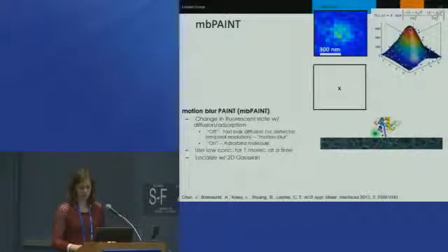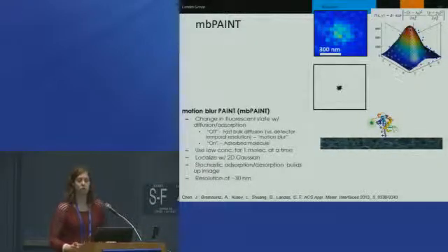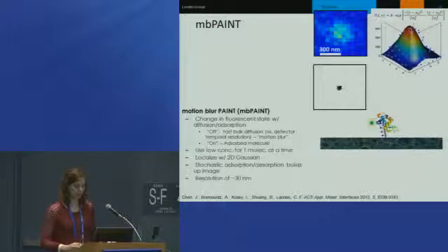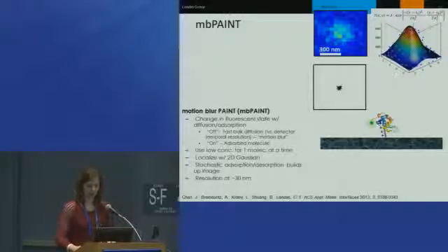And then, like I said, we adjusted the equilibrium so that it doesn't spend a whole lot of time in the off state. And so when we have multiple events, we can do this statistical analysis over and over again. And the combination of these statistics then allows us to create a super resolved image in which we've broken the resolution of light, the diffraction limit, and gives you resolutions that approach things like 10 nanometers or even below, depending on some groups. Some groups claim to get below 10 nanometers. So that's how you use super resolution here in this particular case.